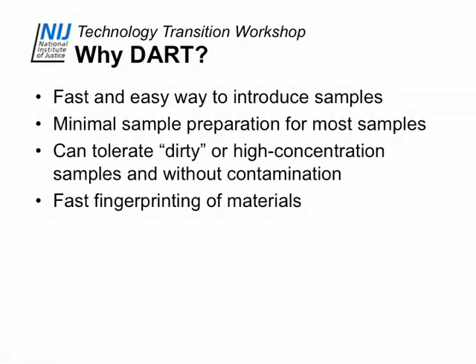We really have run mud and blood and urine and just about everything we can find, wipes off the bottom of the shoes and melted plastic. I like running peanut butter and chocolate as demo samples because you couldn't do that in an ordinary mass spec without messing things up. And it is really good for fast fingerprinting of materials. We'll talk more about what kind of information we get for that, but it is really nice to be able to just stick something in front of a machine and get some kind of information.